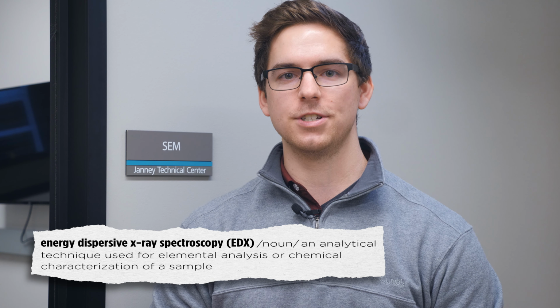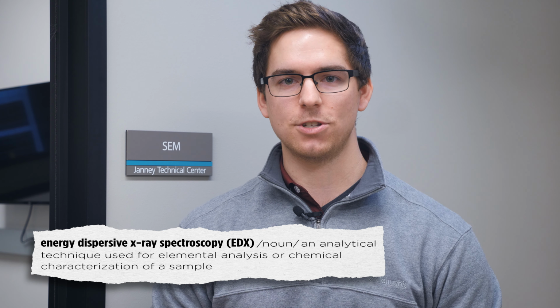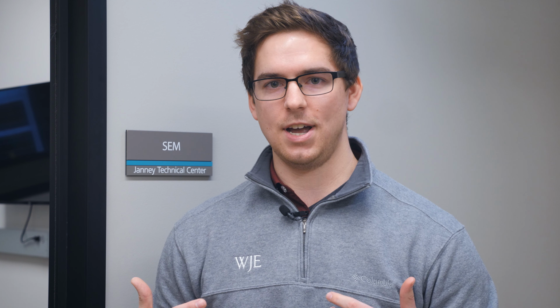Another particularly useful tool for this SEM is the energy dispersive X-ray spectroscopy, also called EDS or EDX. This allows us to look at the elemental constituents of particular samples or deposits that we place inside the SEM chamber. This is particularly useful in determining elements that may be present in identifying corrosion or material degradation.